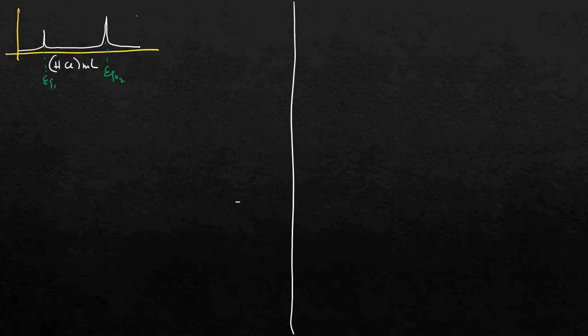All right, now the first equivalent point would give us information as to the number of moles that actually reacted with our carbonate. So remember I said we have sodium carbonate. In an aqueous system, what you have is actually 2 moles of that.